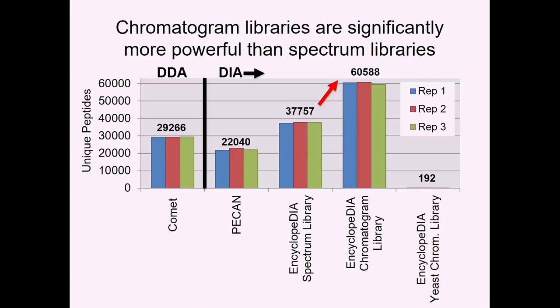I'm wondering if it would actually have the opposite effect, like Isabel was bringing up on Tuesday or Wednesday, where you could potentially gain, but you could also accumulate false discoveries across the multiple different runs. I'll talk a little bit about how we handle things across many different samples and try to minimize that with outliers, but you could generate new ones, and you're also going to have those 1% false discoveries, which in this case is 200 things in each of those results. So even the 1% false discovery peptides tend to accumulate.